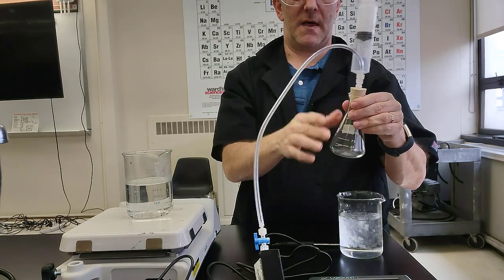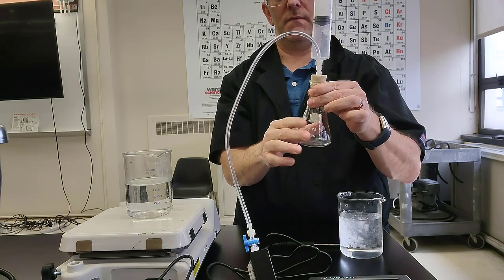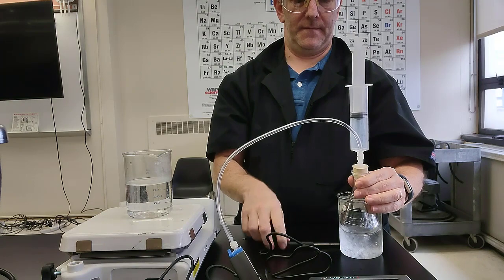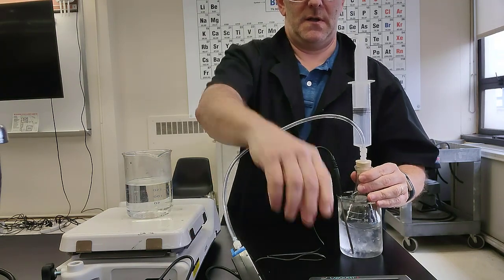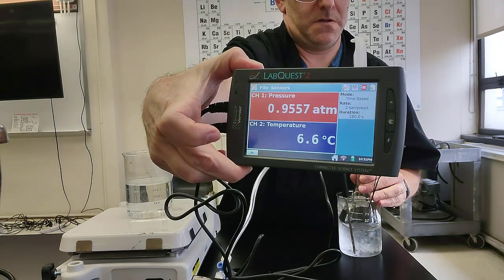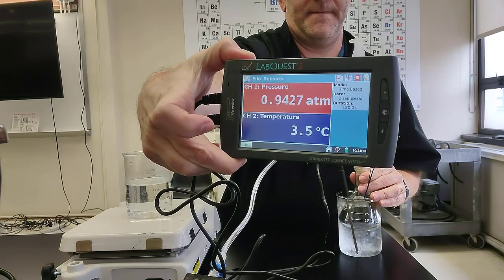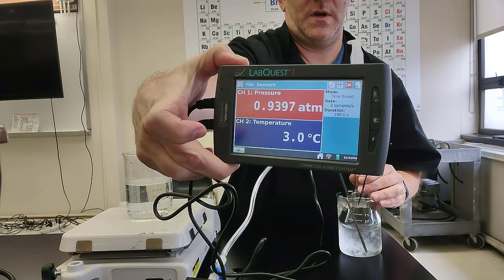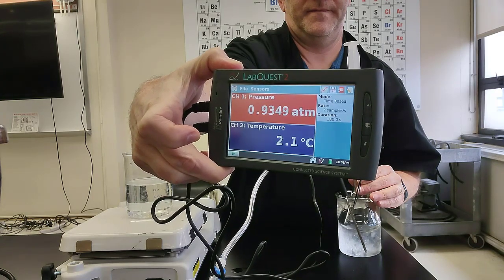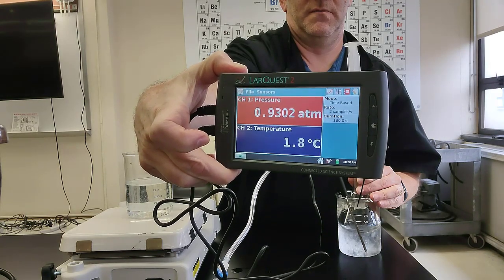Let's try it in the ice bath. The flask is still not really hot, but definitely warm to the touch. Put it in the ice bath, which, if you're curious, should be close to 0. Three degrees, 2.5 degrees. One and a half degrees.